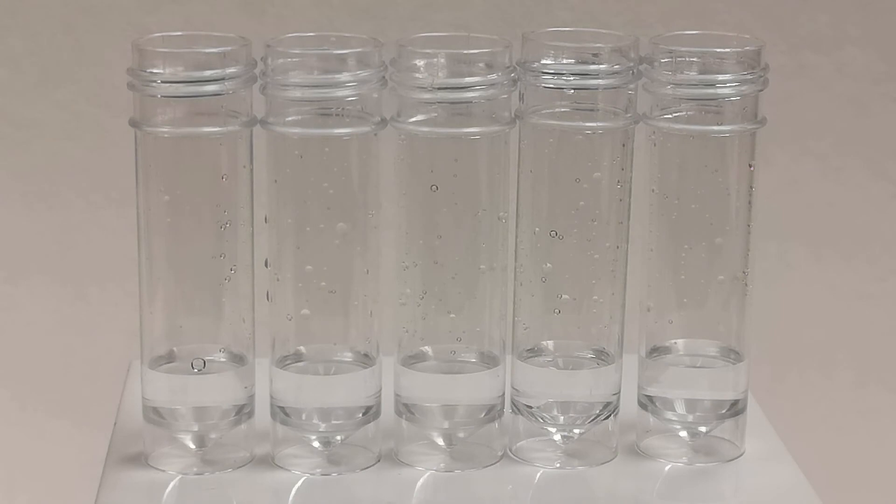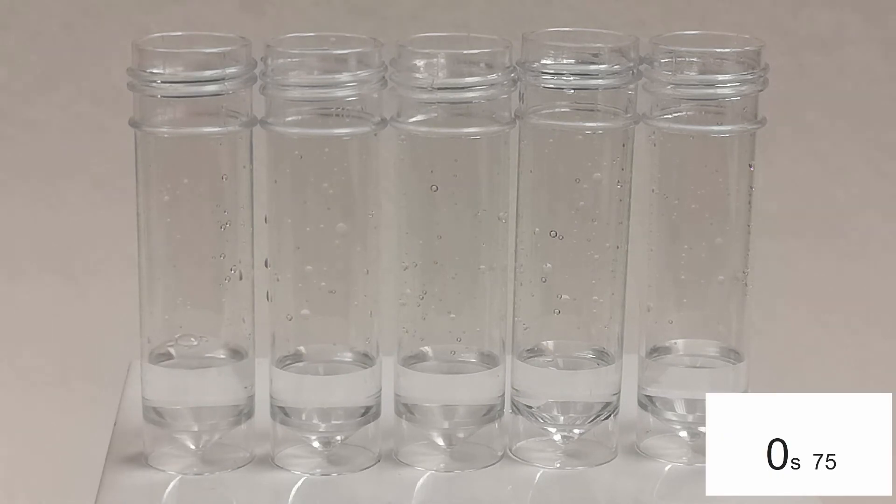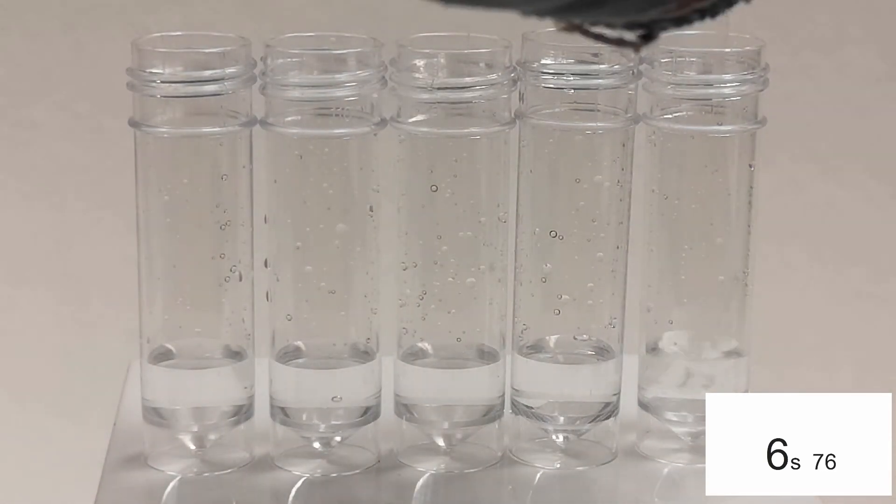Another reaction that could be used to investigate reaction rates is the iodine clock. This is the reaction between potassium iodide and hydrogen peroxide. The solution also contains sodium thiosulfate and starch solution.